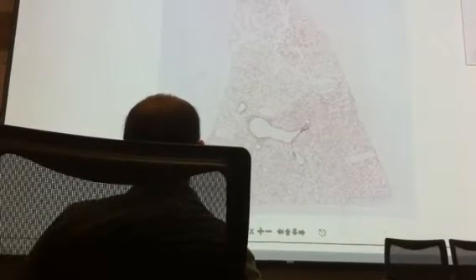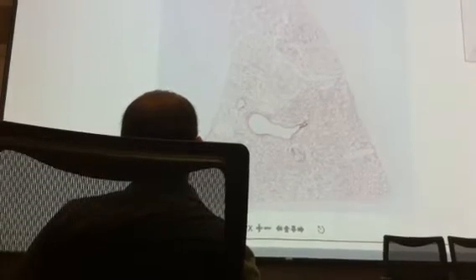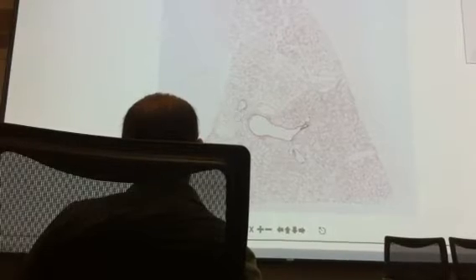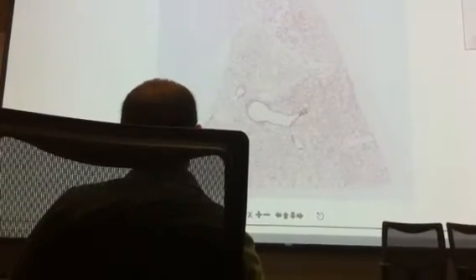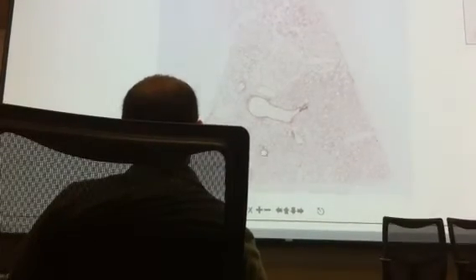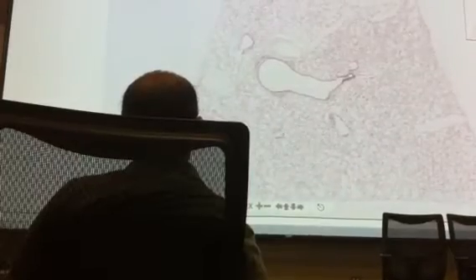Not that great. And this one's the lung. Even at low power, you can see some of the different structures. You can see that this is a bronchus here, okay? And then you've got some bronchioles. And then you're going to get down to those terminal bronchioles with the respiratory bronchiole coming out of it. And you can actually see some of those alveolar ducts and the alveoli. So even at low power, you can see quite a bit on this one.